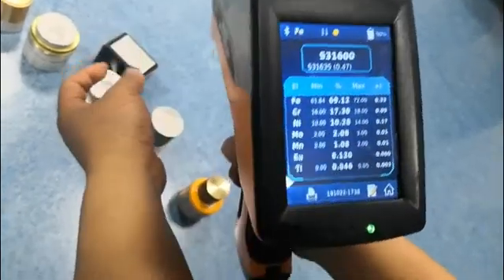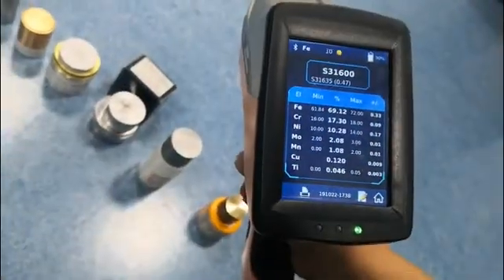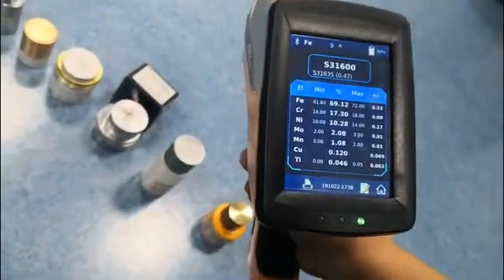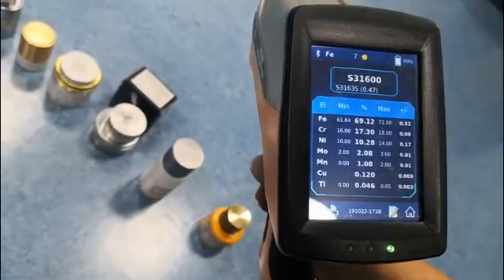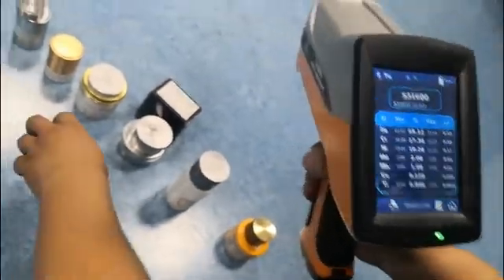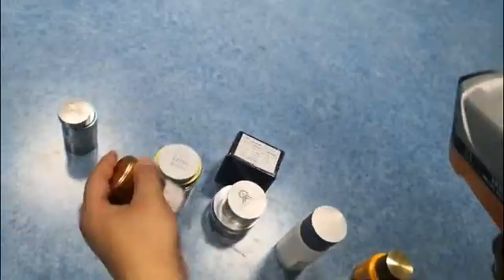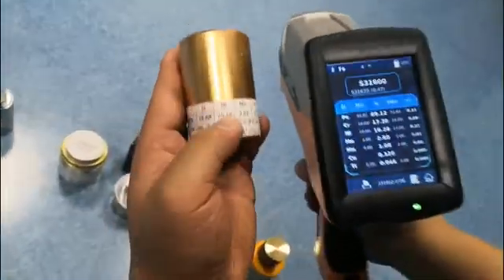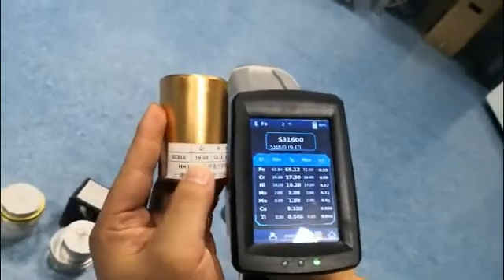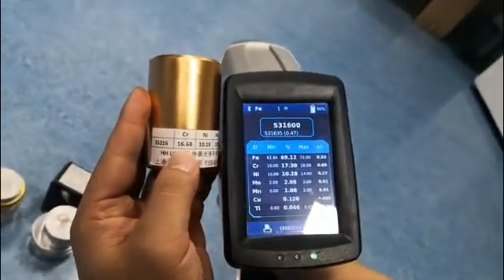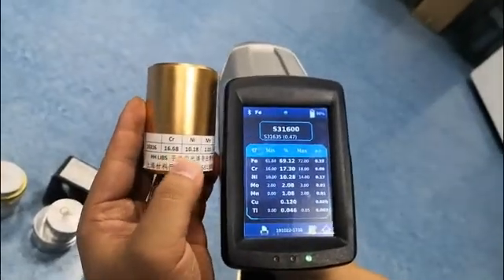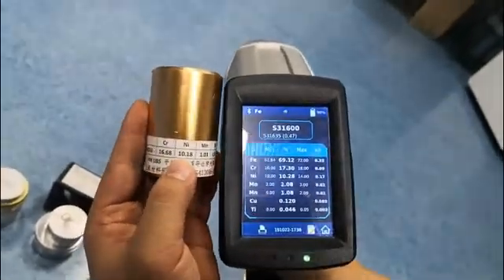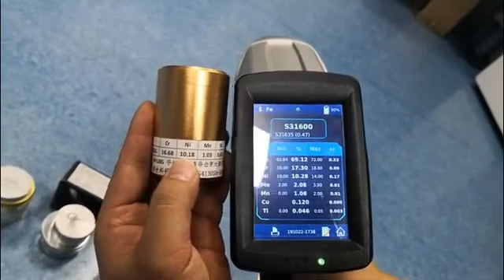You can see here, this is 316. Now we compare with the standard sample. Chrome, nickel.